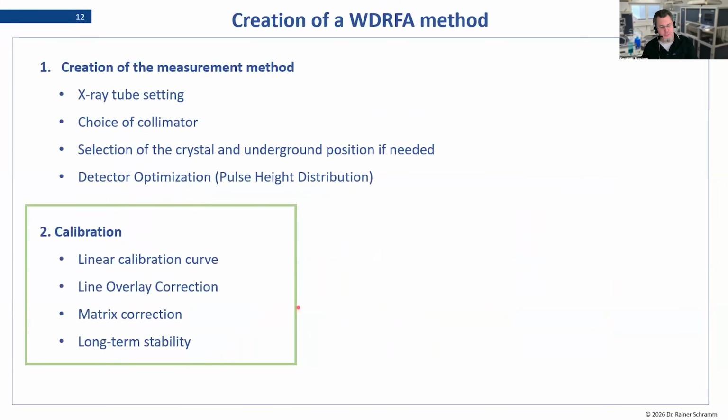So that was the first topic: the setting up of our line parameters, of the measurement parameters for the elements.